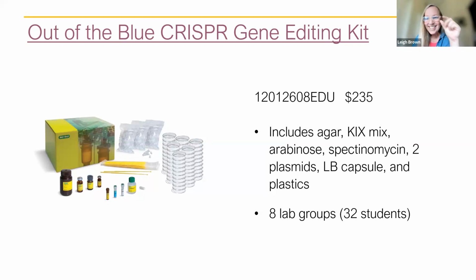If you can pour your plates thin and you have extra plates to pour them, okay? So this lab, the limiting factor for me is the plasmid. Yep, the plasmid, right? I know, me too. I'm always like, oh, I have to order more plasmid. I have so many plates, but yeah. So they give you plenty of agar.